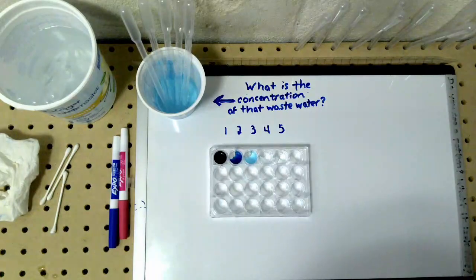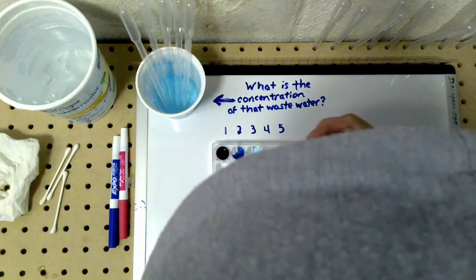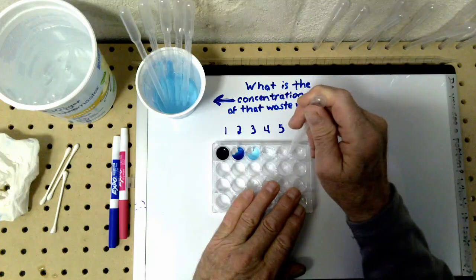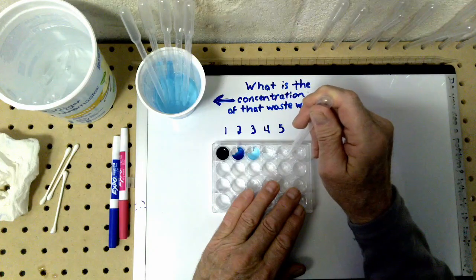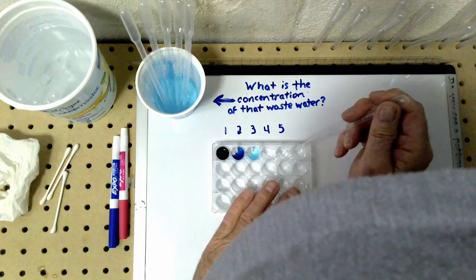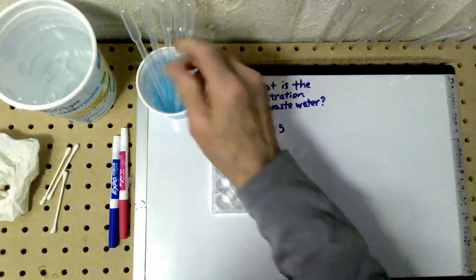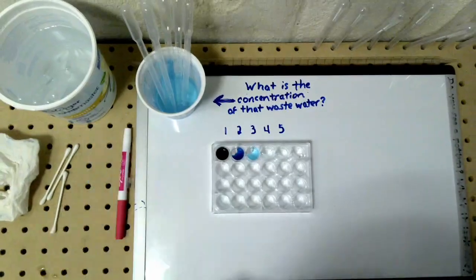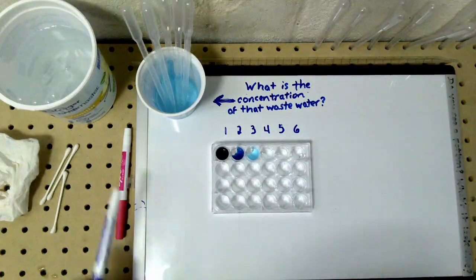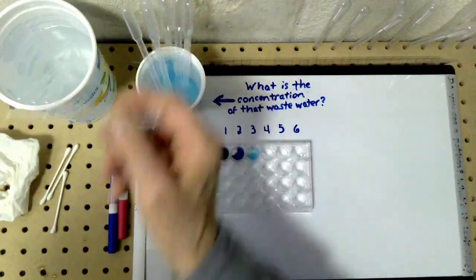9 drops there. Now, I get another pipette. That all mixed up. Make sure it's well mixed. And I don't even know if I see any food coloring in that anymore, but I'll take one of those drops. We know there is some. Okay. Now that would be 1/1,000,000 of a concentration, or times 1,000,000. But we haven't got it times 1,000,000 yet until we put the water in.